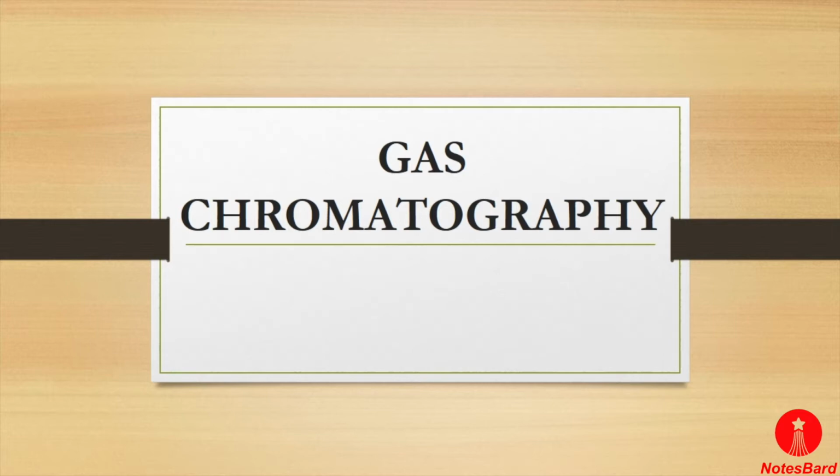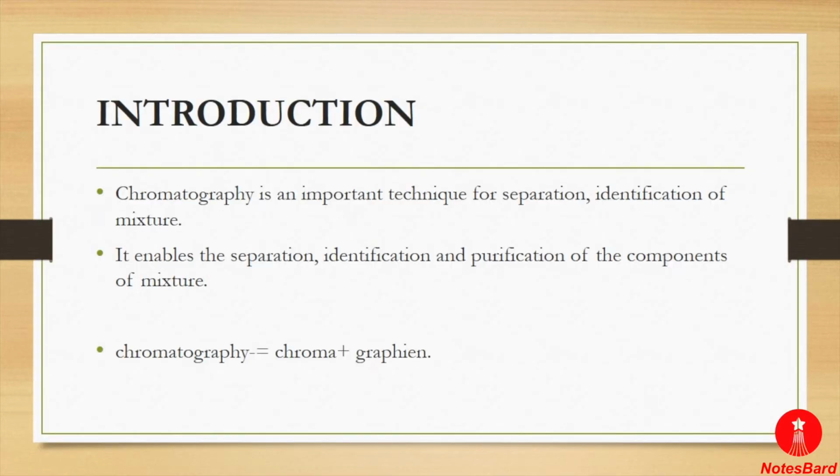So in this video lecture we will discuss another type of chromatography, which is called gas chromatography. So let's start with the introductory part. Before moving to gas chromatography, let's understand some basic facts about chromatography.